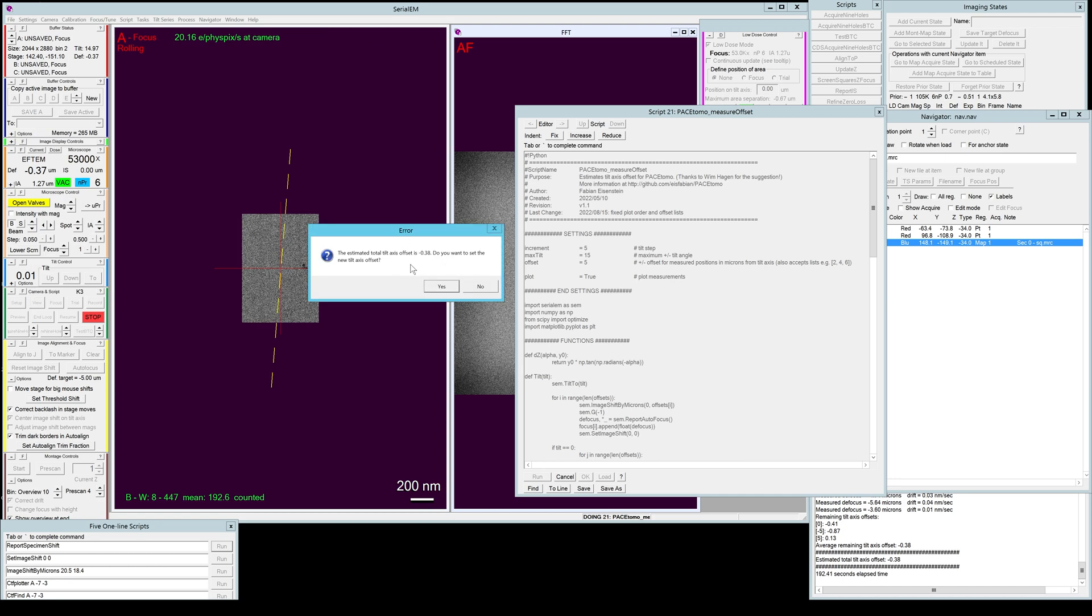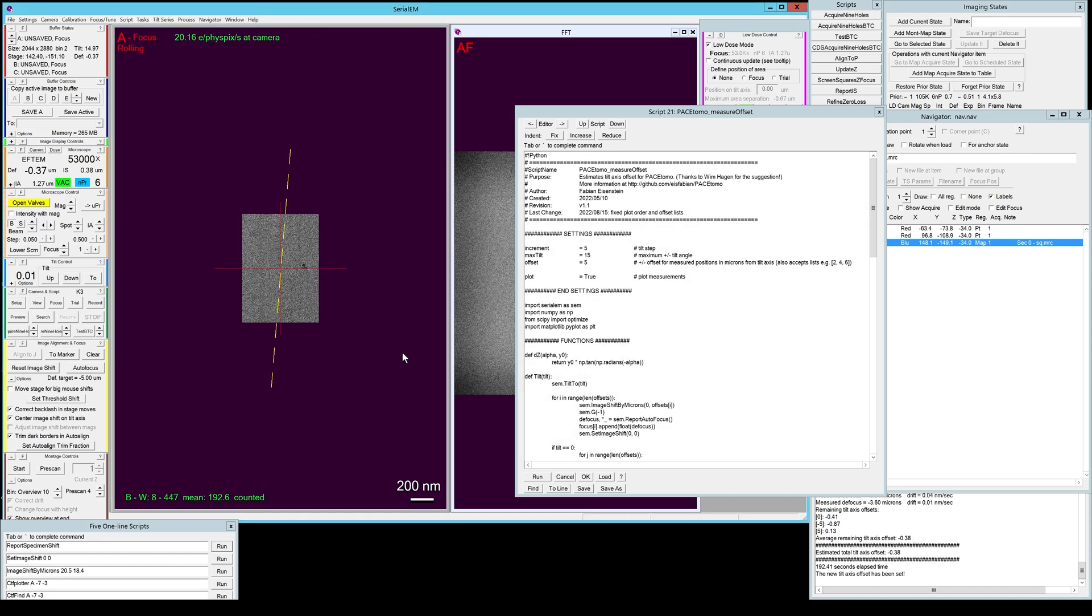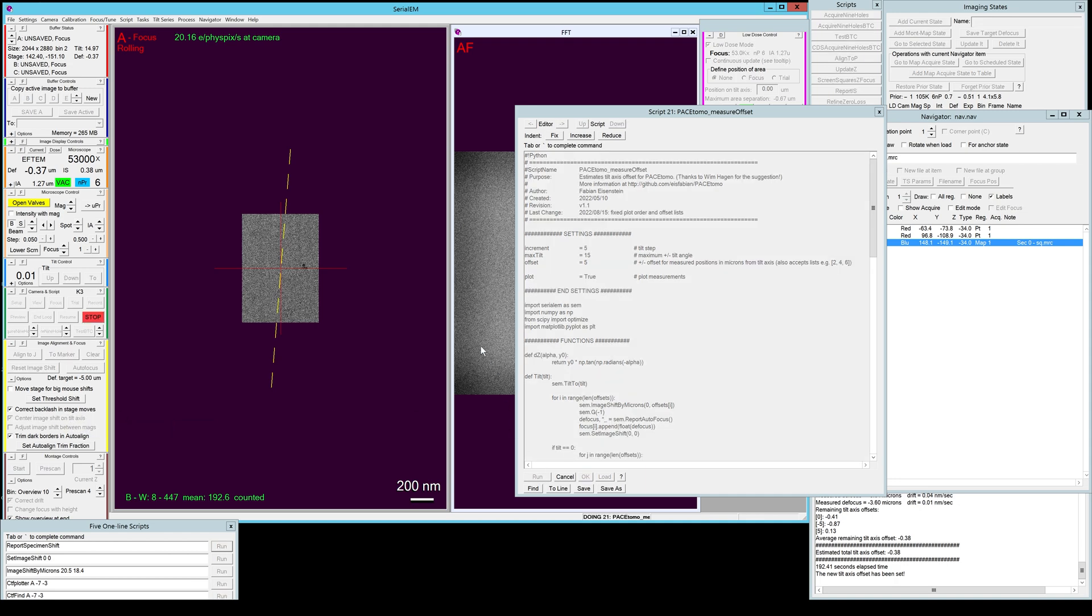Alright, if you're done you can close this. It will ask you if you actually want to apply this tilt axis offset, so we're just going to do yes. And what you now have to make sure is that you would check 'center image shift on tilt axis.' If you've done that you can actually go ahead and run it again and you should see a better result close to zero for your estimated total tilt axis offset.